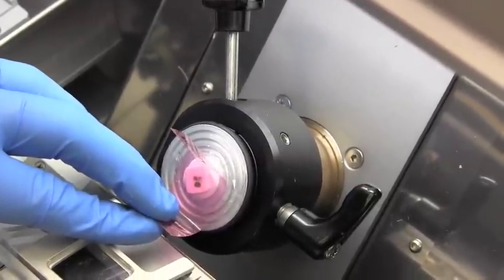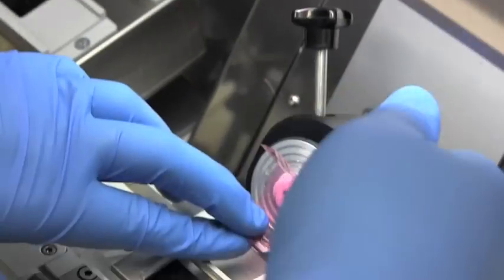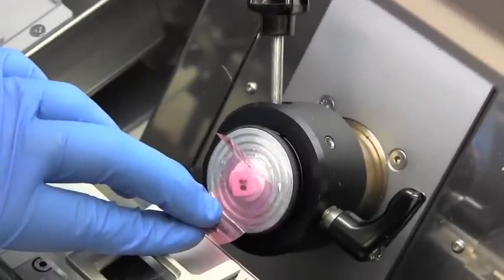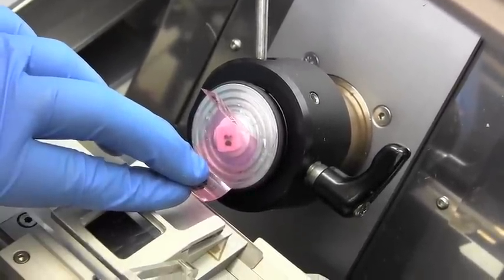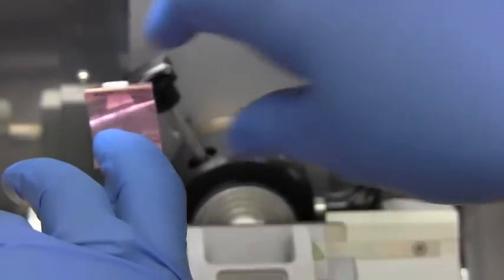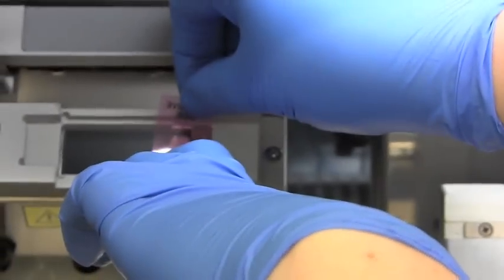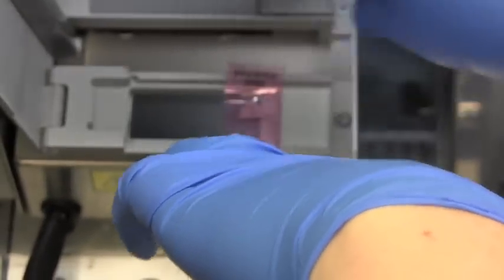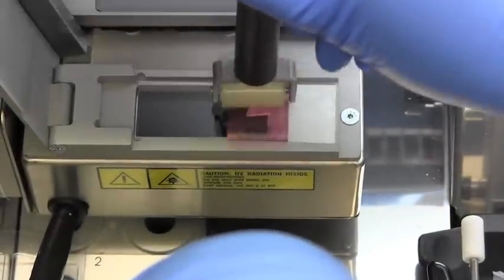Advance the wheel forward on the fine setting, making sure you're not still trimming. Cut an 18 micron slice and pull the tape towards you gently and quickly so that you don't have any tape sticking to the blade. As you pull it off you should be able to get a nice section that you can put onto the slide, then roll that section on.